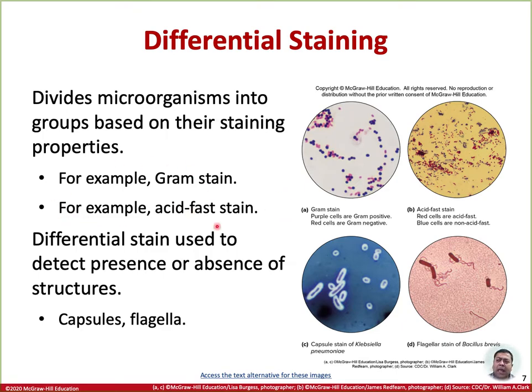with the charge. There are also differential stains used to stain some of the cells, which are called acid fast. That means these cells have a property that when they are washed with acidic alcohol, they retain their staining. Just as there are some clothes which are color fast, that means that washing will not take the color away.